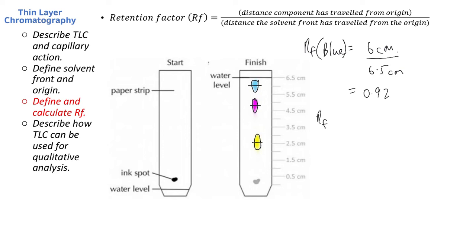The Rf of the pink, we would say is maybe 4.8-ish, 4.8 divided by 6.5, which is 0.74.